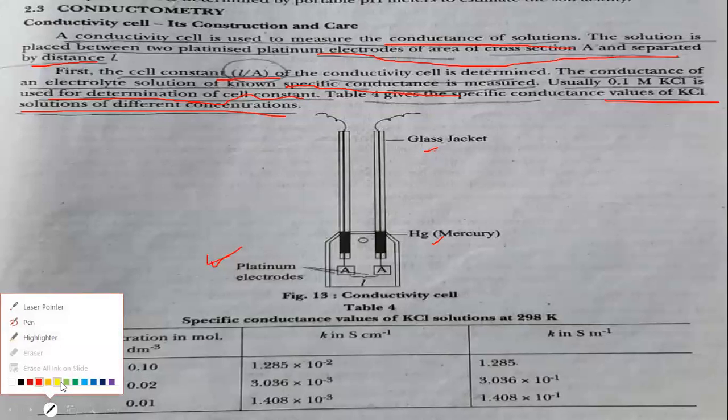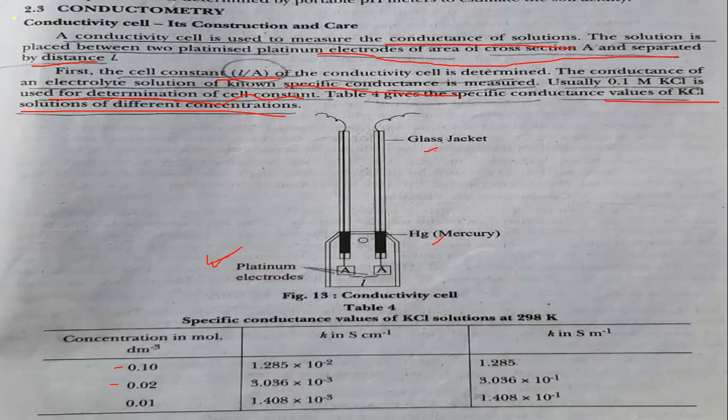Hello everybody. Here in this lecture, we are going to focus upon conductometry. So in conductometry, we'll first see what is a conductivity cell, its construction and the care.